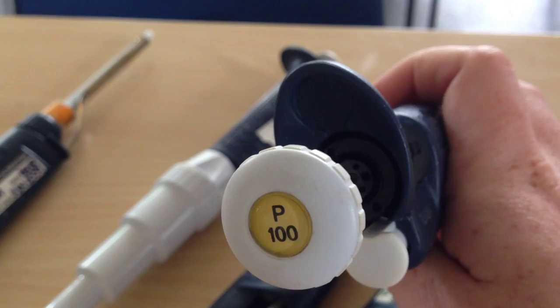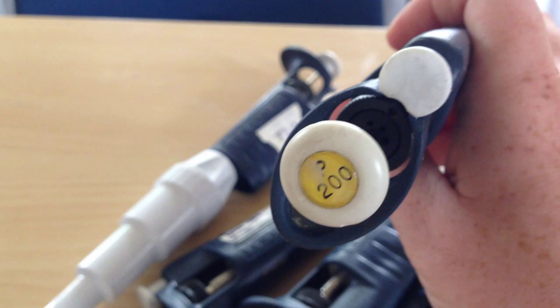So what you want to use is the smallest possible Gilson available. Then we have a P200. You can see this one is quite a lot older. You would use that for the volumes between 100 and 200 microliters.